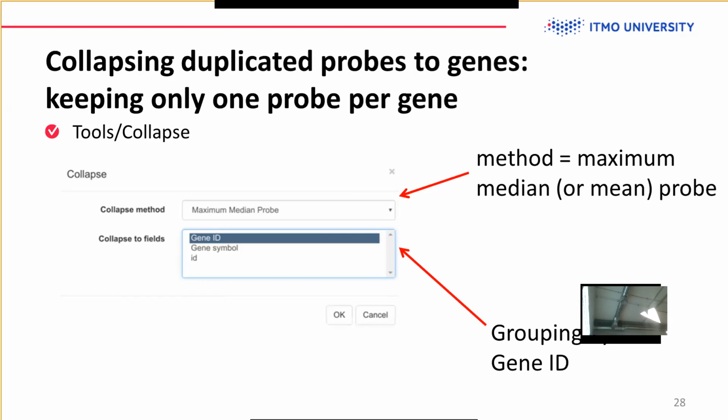We have about 40,000 probes here, so this is a gene level microarray. There are microarrays that have a million probes, and from those you can work with exon level expression. You can say that this exon is more expressed than that one. But again, getting from exons to particular isoforms is not trivial.